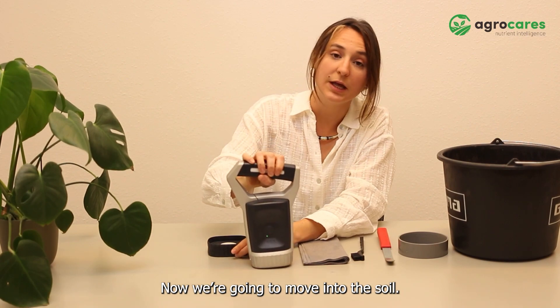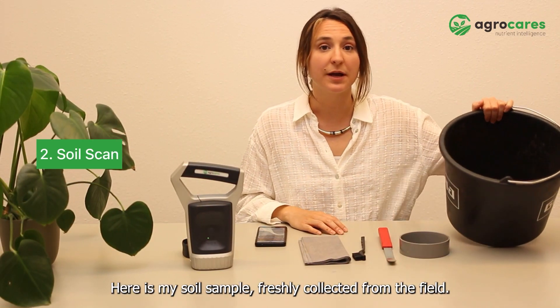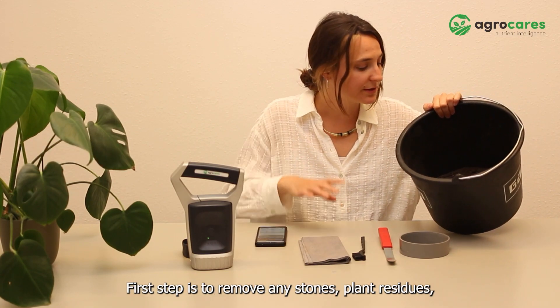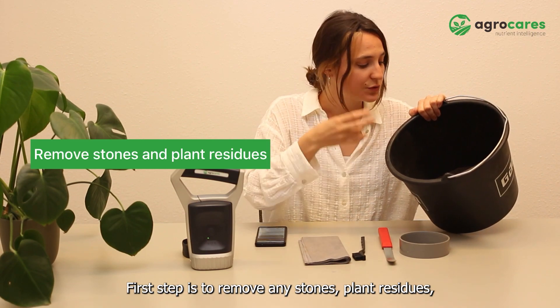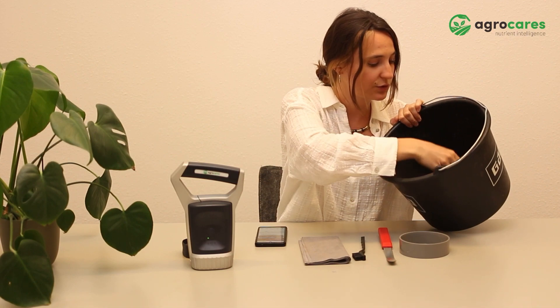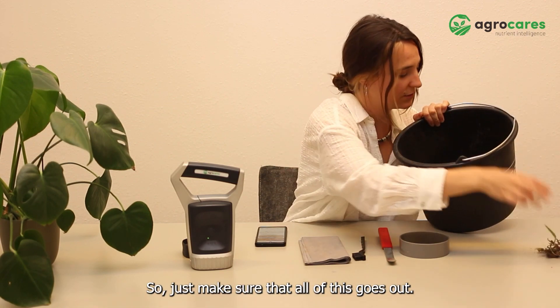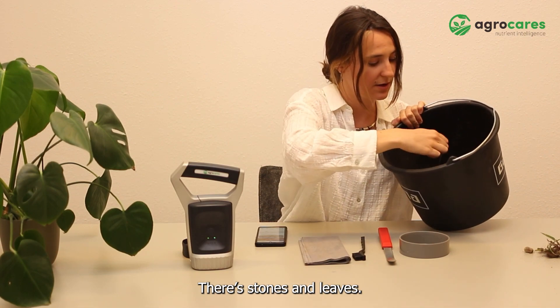Now we're going to move into the soil. Next step is to scan the soil. Here's my soil sample freshly collected from the field. First step is to remove any stones, plant residues, roots, and leaves that you might have collected. Just make sure that all of this goes out — there are stones and leaves.